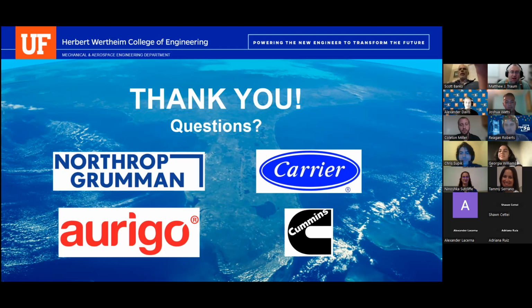Really nice presentation. I am not intimately familiar with the customer requirements, but it seems like a key element of your product is the variety of different shaker paths that you can do, the figure eight, the linear, the circular, and it looks like variations in between.